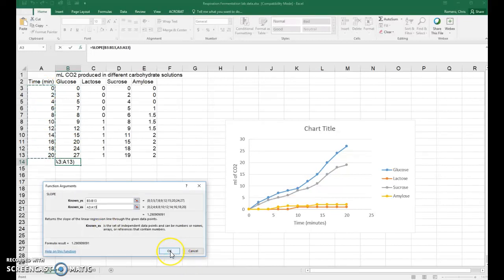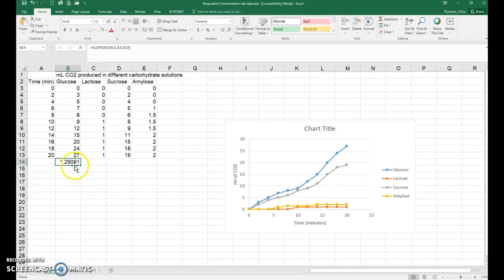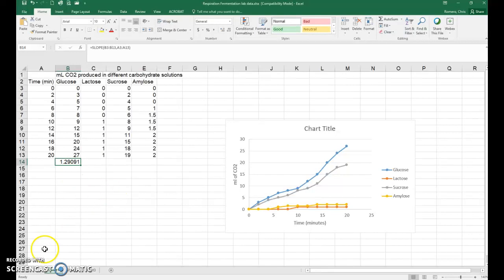And then we'll just click on OK, and there's your rate. Now remember, the units of your rate are milliliters of carbon dioxide per minute. That's how you calculate the rate for the cellular respiration lab.